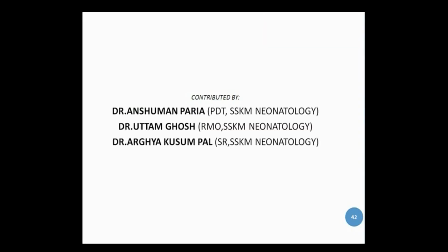We hope this entire demonstration has been beneficial to you in order to start total parenteral nutrition preparation under strict asepsis at your setup. Remember to maintain strict asepsis, including surgical scrubbing and gowning. Remember to use the sterile surface for mixing different constituents, preferably under a laminar flow.